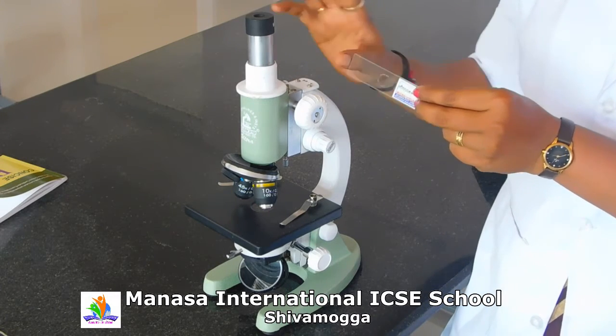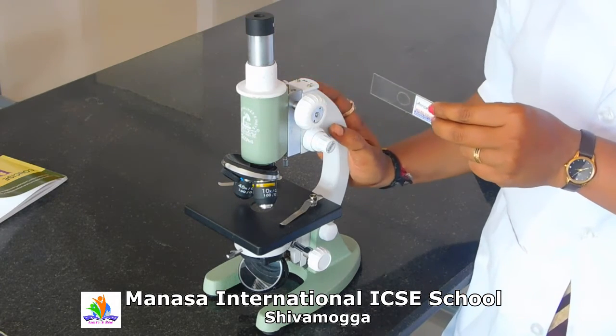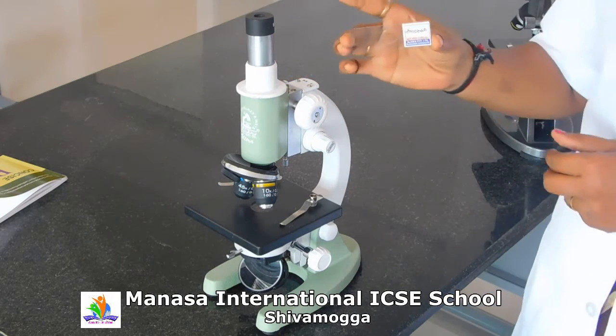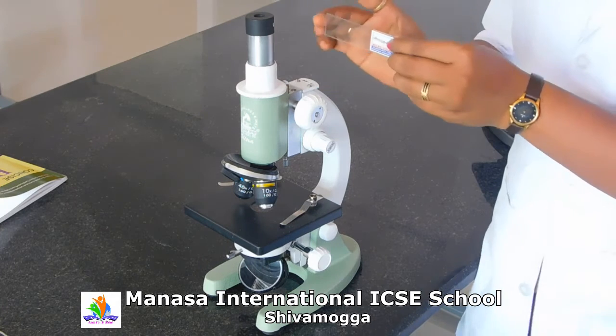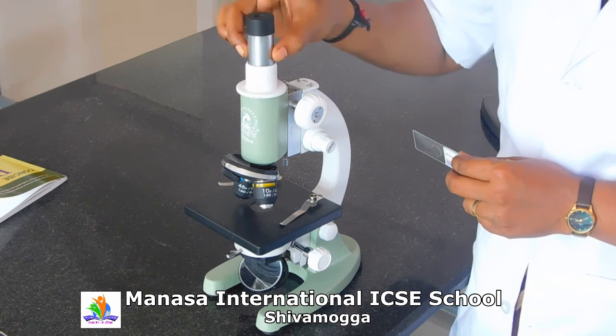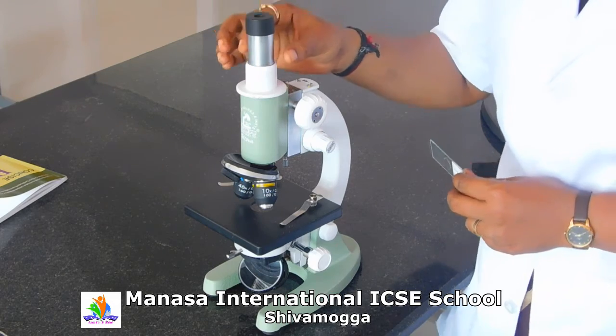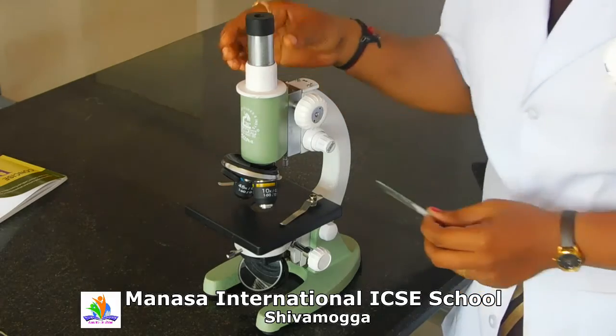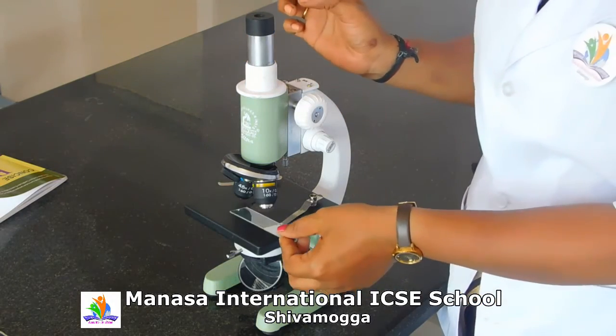Now, let us study the complete parts of the compound microscope. Okay, this is the slide. First we'll come from the starting. This is the eyepiece. This part is called the eyepiece, where you just bend and focus to observe the slide which is placed here.